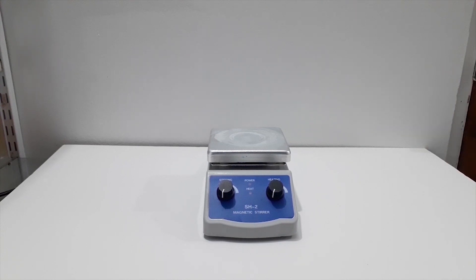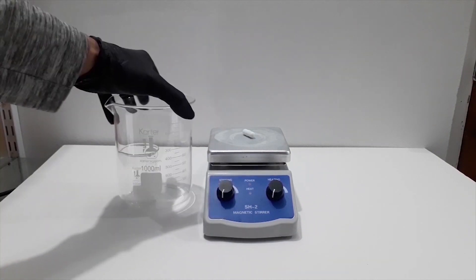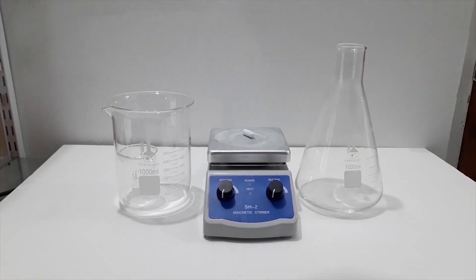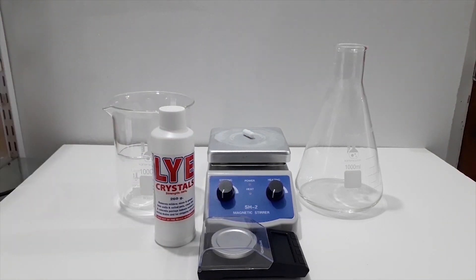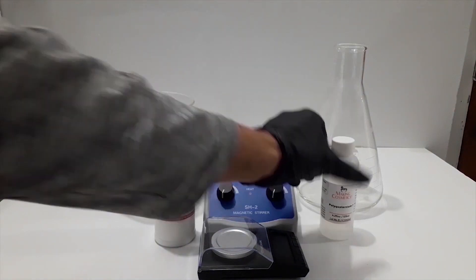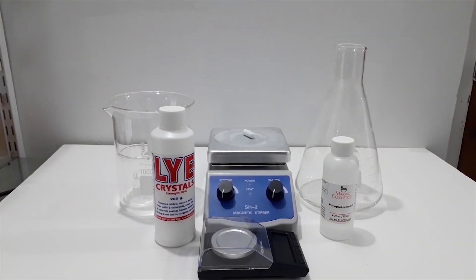While that's curing, we can work on preparing the dechlorination solution. For this, what we need is a hot plate stirrer, beakers, an Erlenmeyer flask, and a digital scale. The reagents used in this dechlorination solution are sodium hydroxide and a quaternary ammonium salt to act as a phase transfer catalyst.